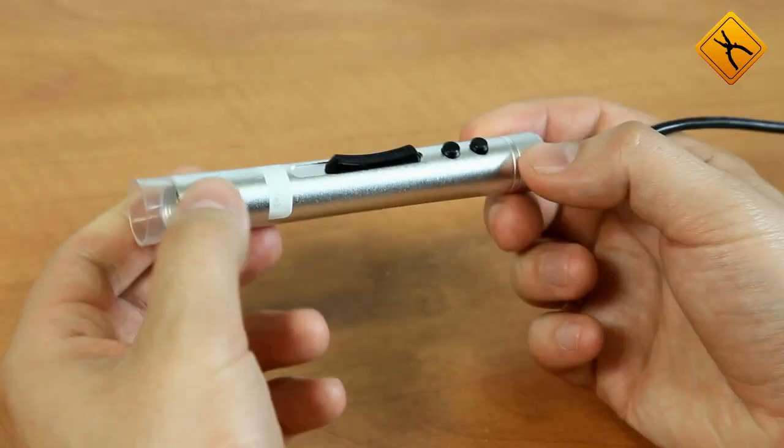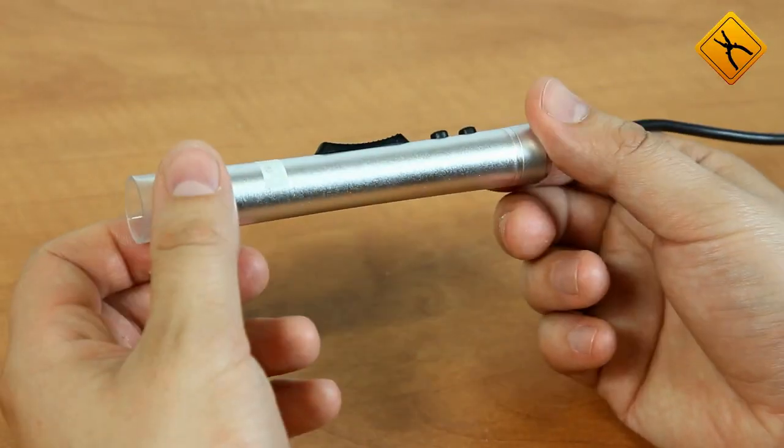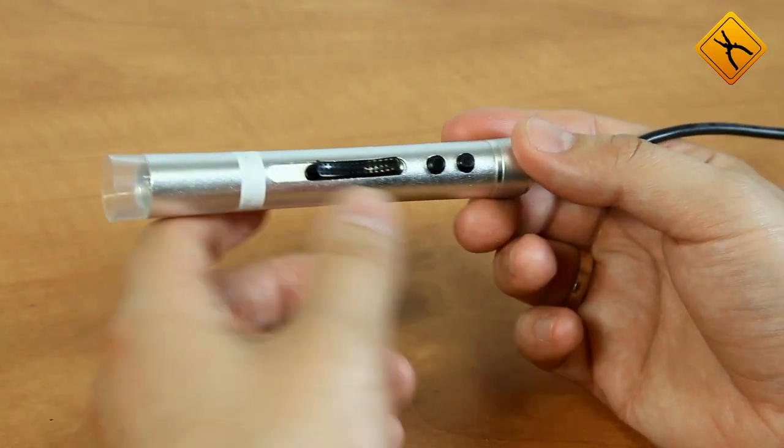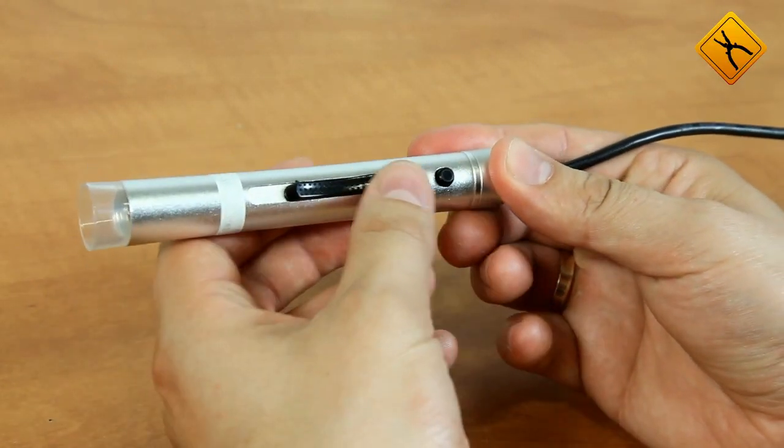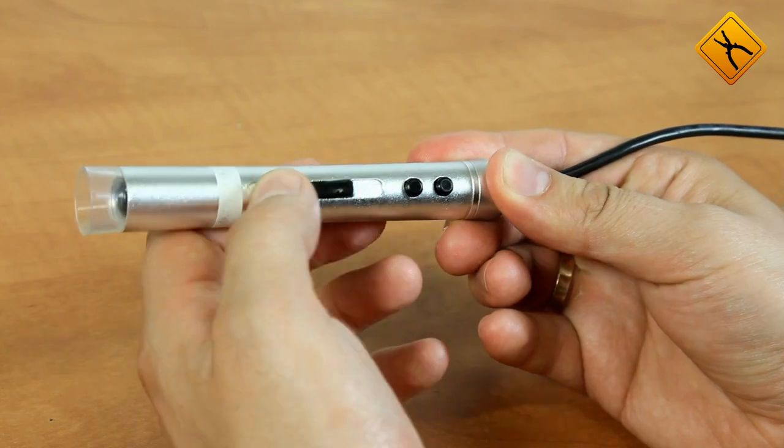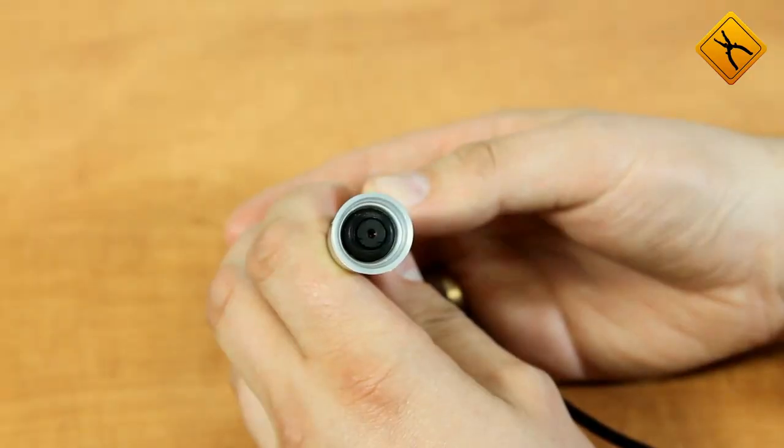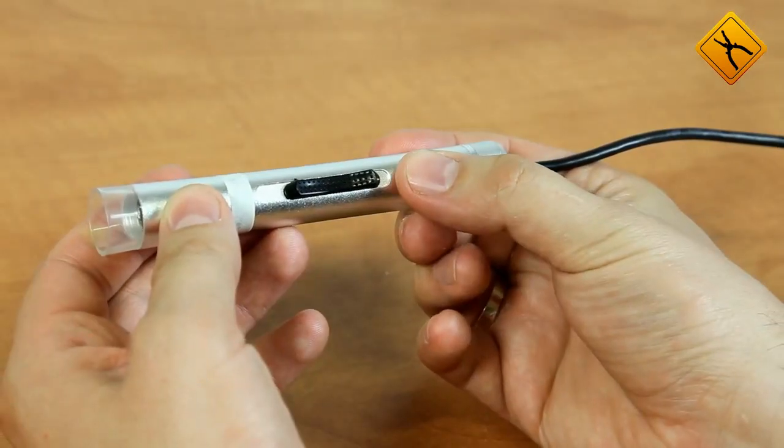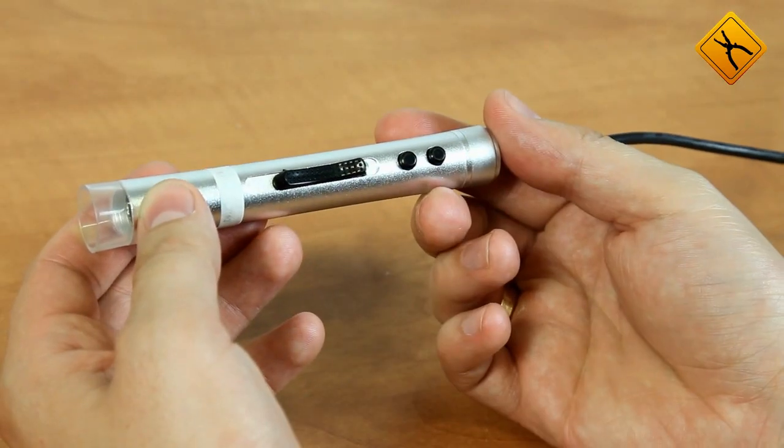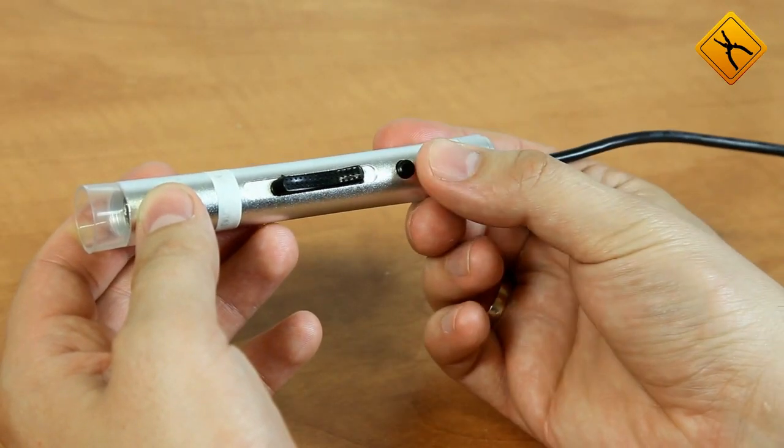The microscope is shaped as a cylinder and is made of plastic. There are three buttons in total: focus adjustment, which changes the position of the optical system, a snapshot button, and a button for illumination.